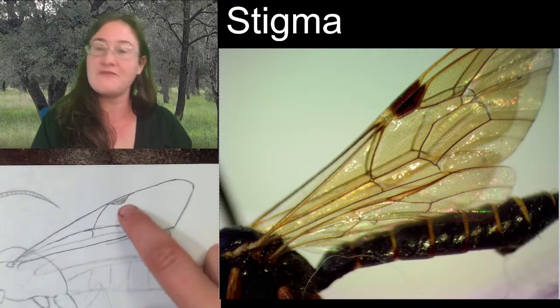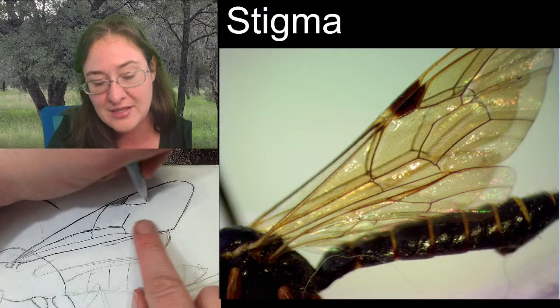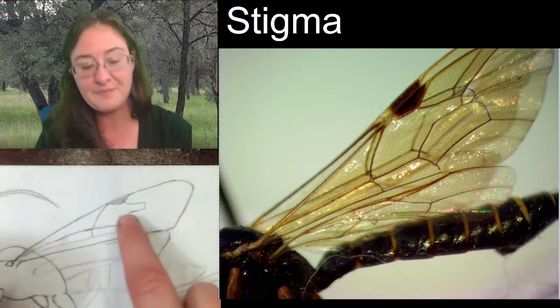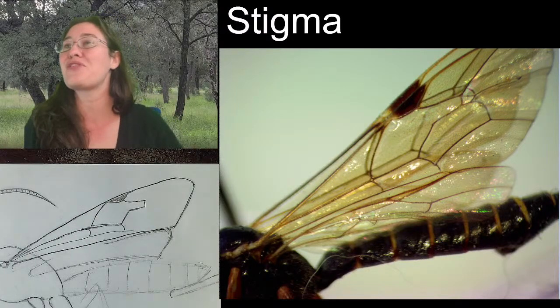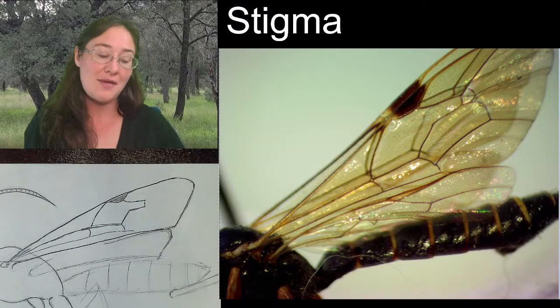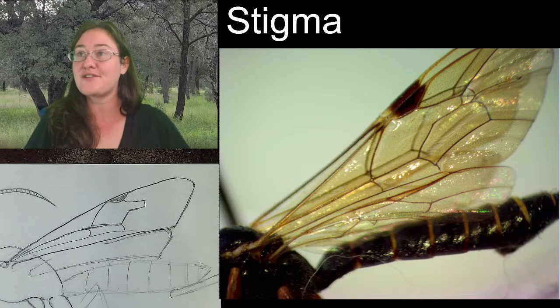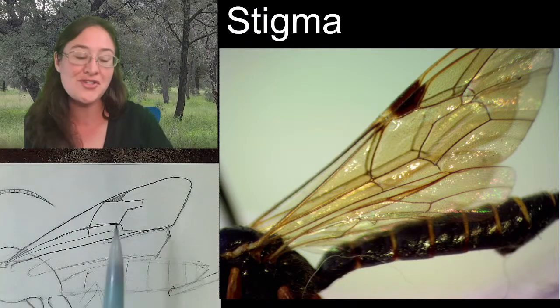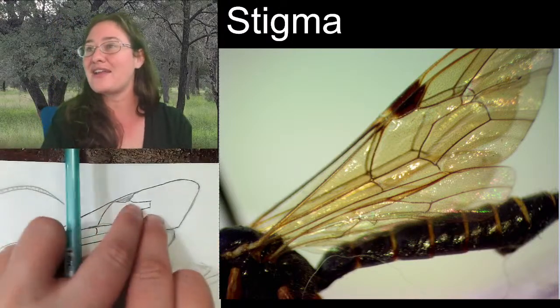Because if we start from this stigma down here, and then we go out like this, and come down and over, this shape right here, that's how we know that this wasp is an ichneumonid wasp. Our family level identification characteristic is right here. They have what we call a horse head in the wings. All right. It looks like a neck and a face.